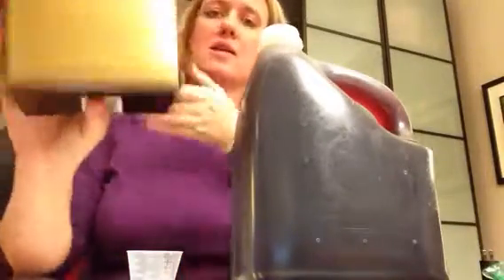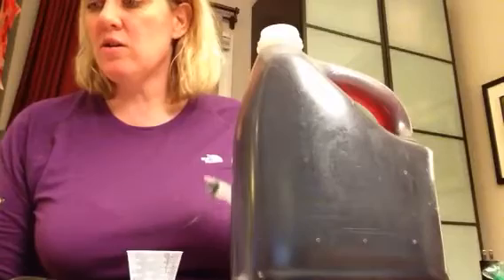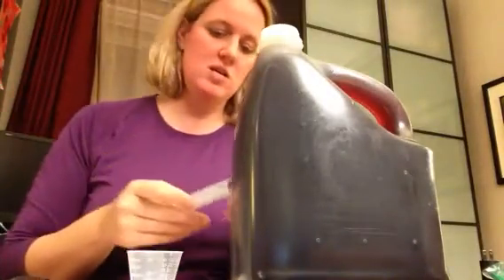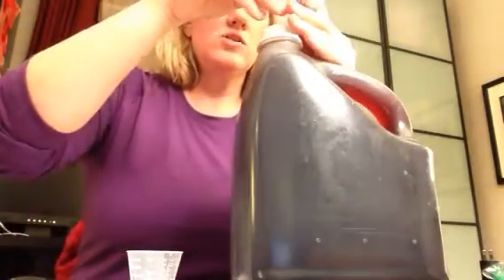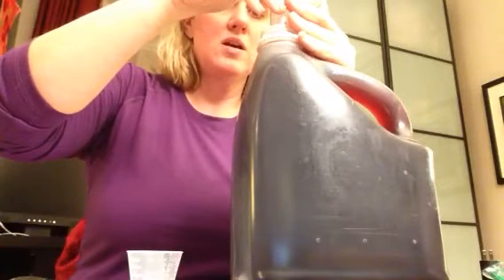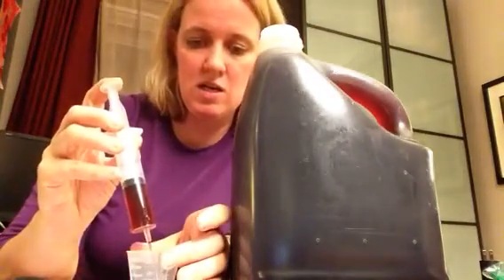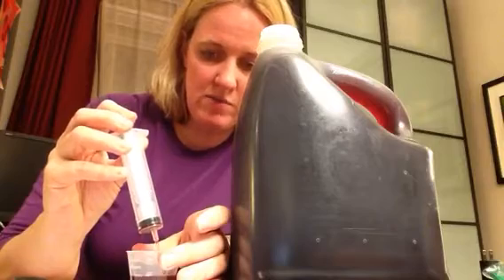And I'm going to follow this acid testing kit — you can get these online or in any local wine store. We start out by using the plastic syringe measuring 15 cc, which is also the same as milliliters. Cc and ml are the same. This all came in the testing kit, and I'm going to put that into the cup that also came with the testing kit.